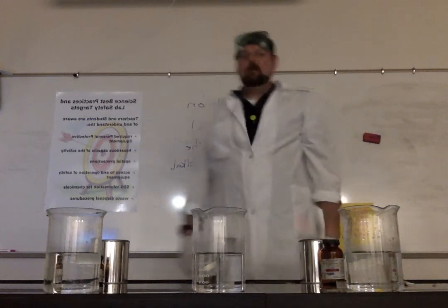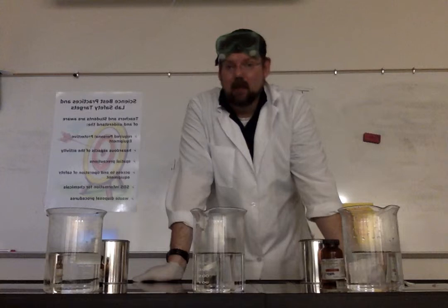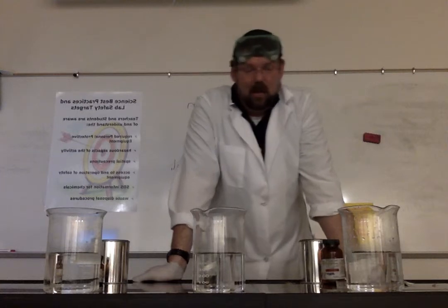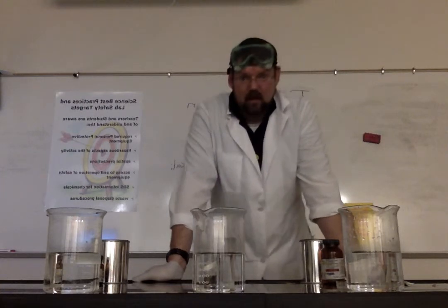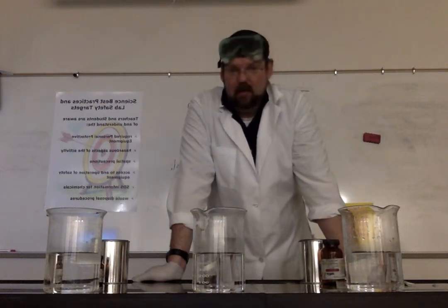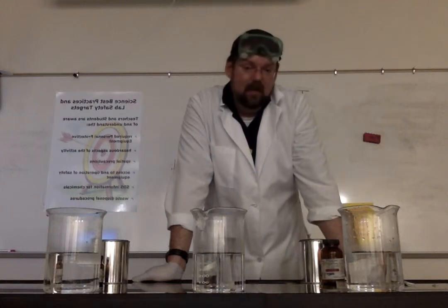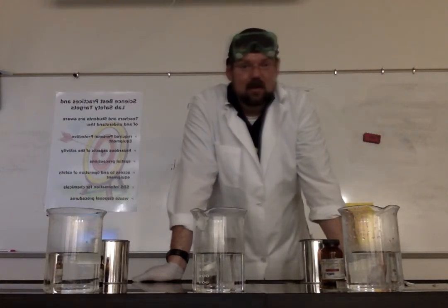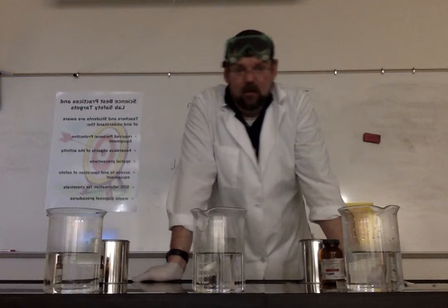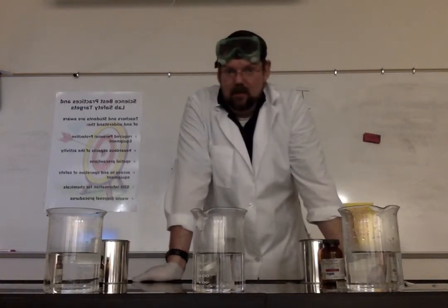The protective equipment. You all came in here, even though it's a demonstration, we had you lab appropriate. Since you are lab appropriate, that means that you have socks on, shoes on, long pants, hopefully jeans. You have short sleeve shirt, not too baggy. This is to protect you just in case something does go a little bit wrong. And usually, if you're lab appropriate, that takes care of just about everything.